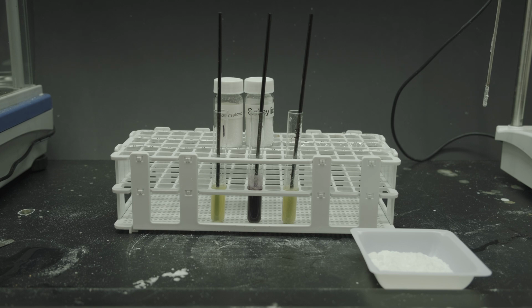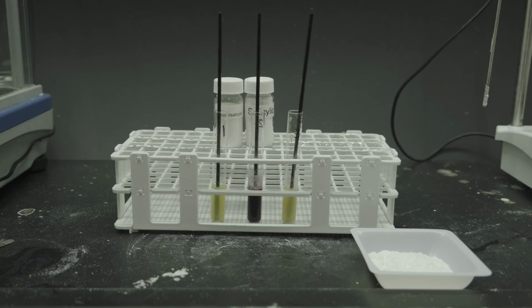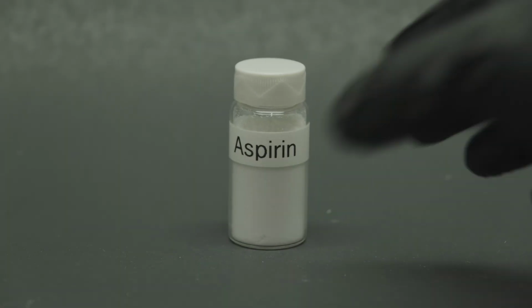Aspirin wouldn't react in this reaction because there's no OH group for the ferric nitrate to react with, which means that the chance that I had succeeded had gone up. But just to be extra safe that what I had here was truly aspirin, I decided to still put it in my melting point apparatus, and just as it was reaching around 135 to 136 C, I saw that my sample had melted. So at this point, I was almost positively certain that what I had here was truly aspirin.